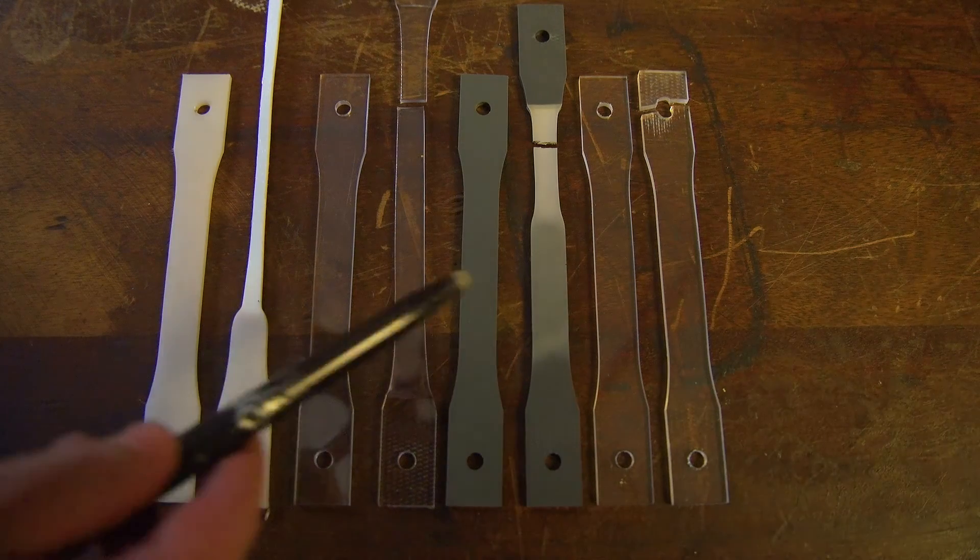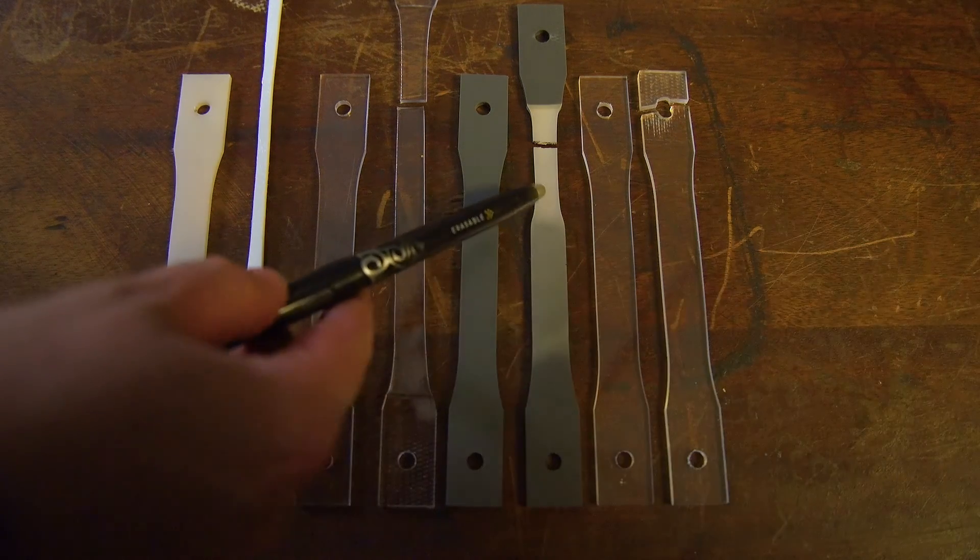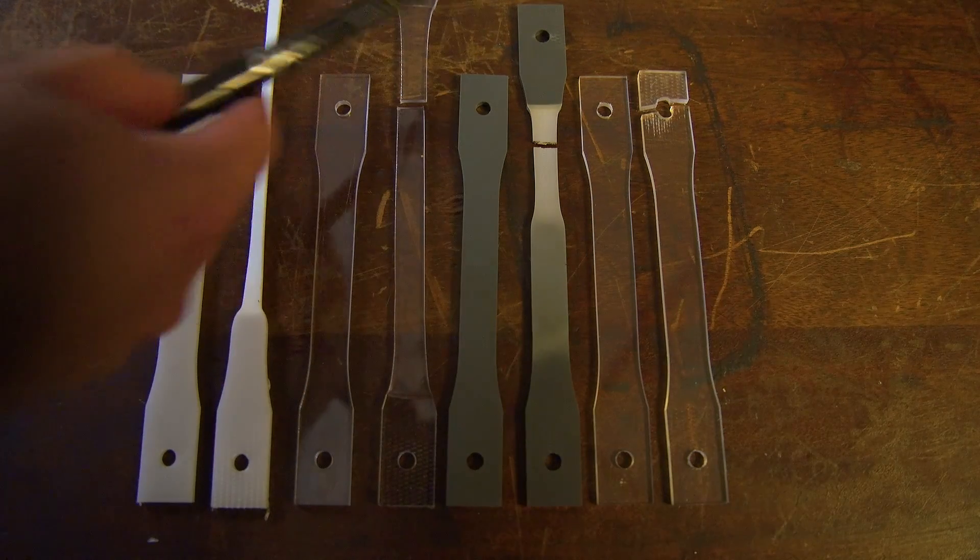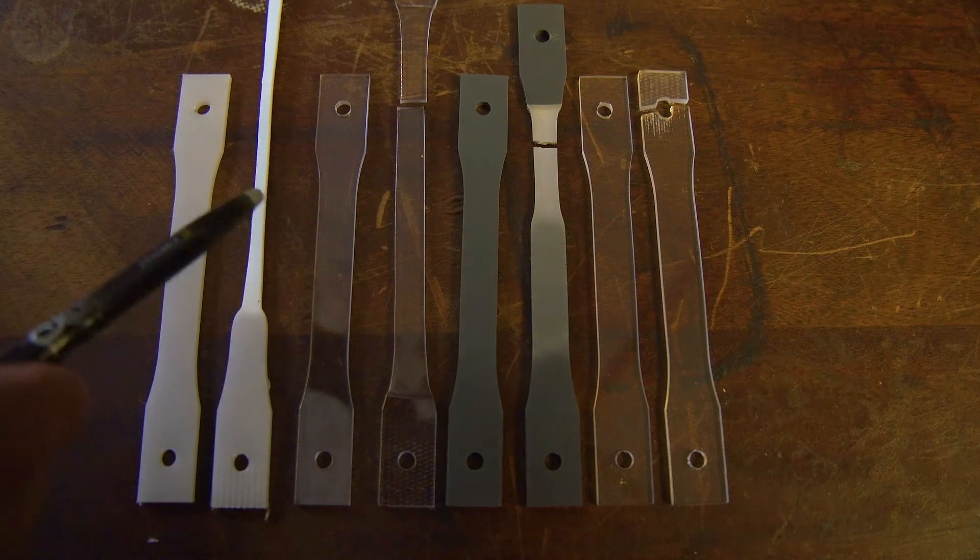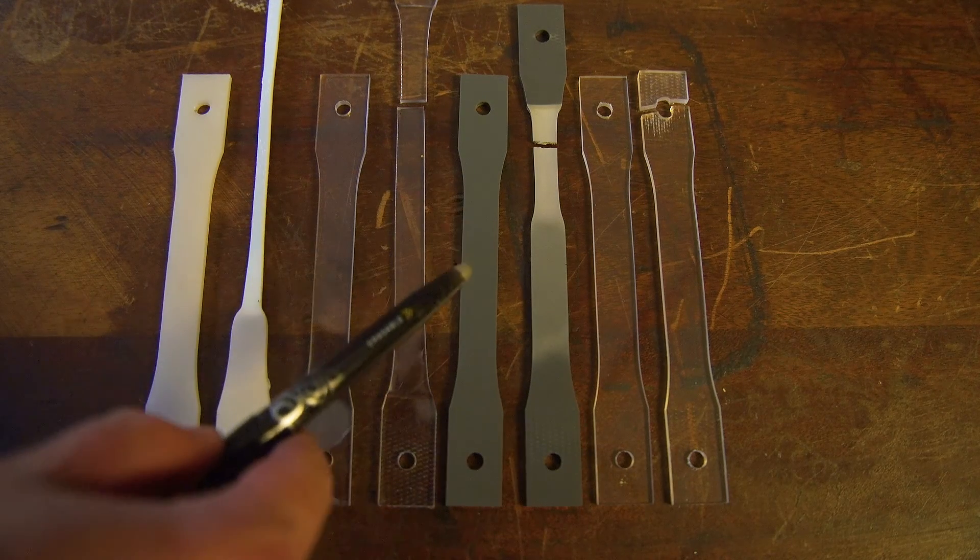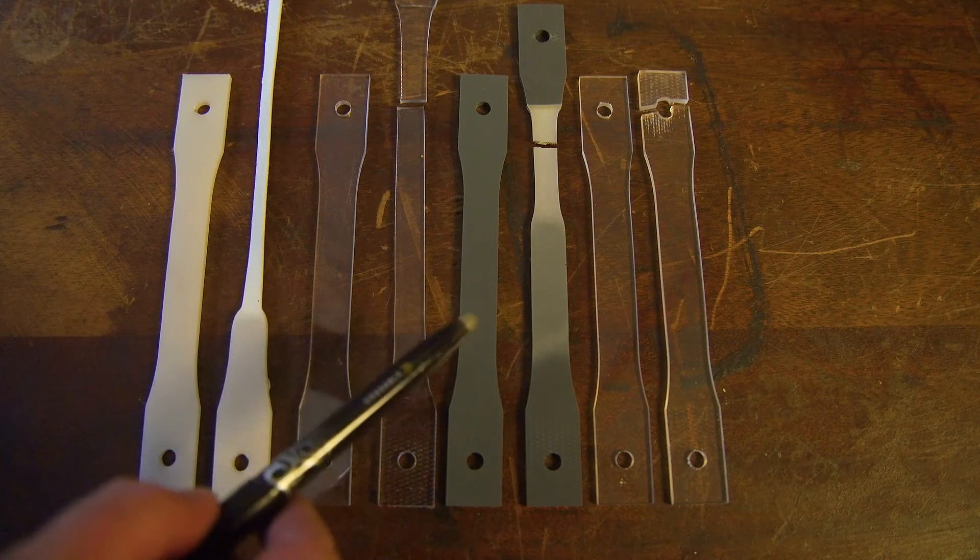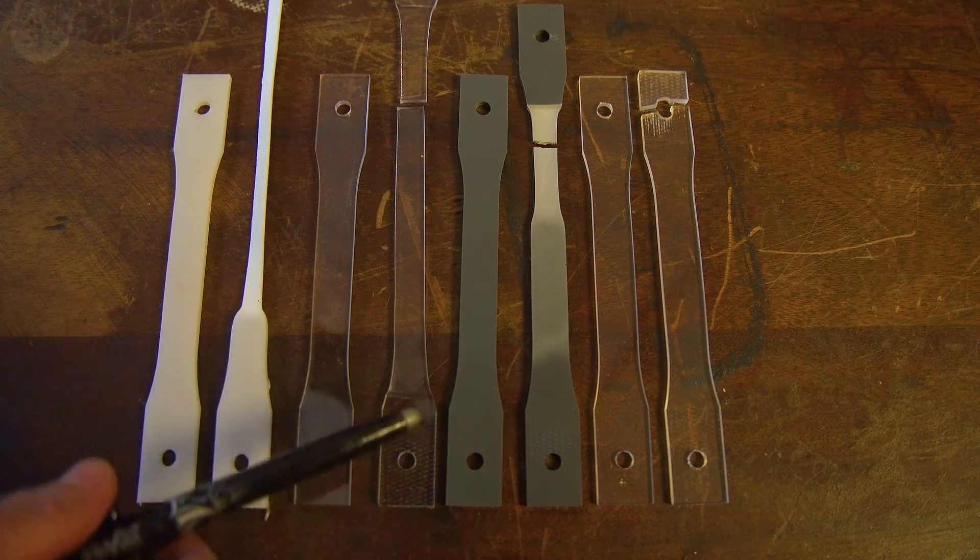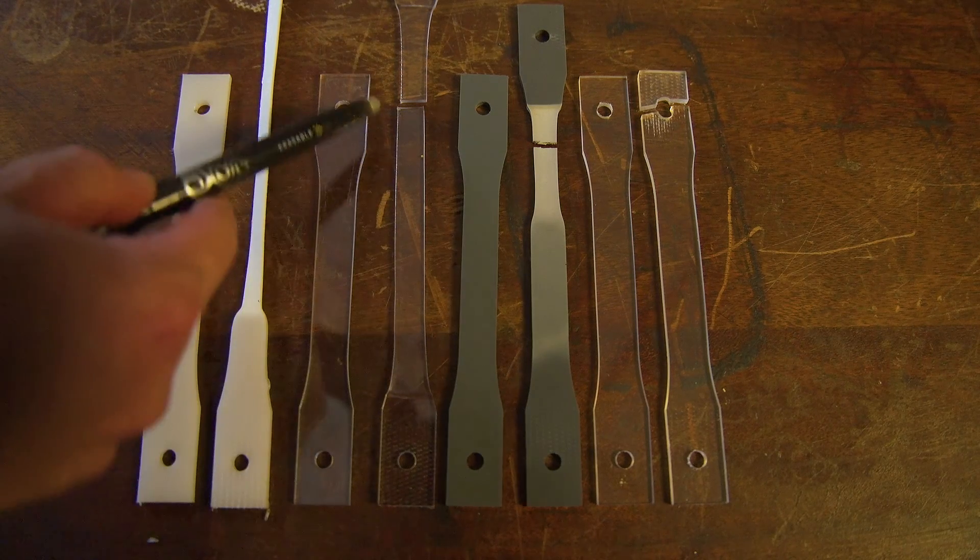Our PVC sample exhibited stress whitening and crazing, and it did exhibit a bit of plastic deformation. Similarly, the polycarbonate sample also exhibited a bit more plastic deformation than the PVC sample, and it also had a bit of crystallization, which resulted in a change in opacity.